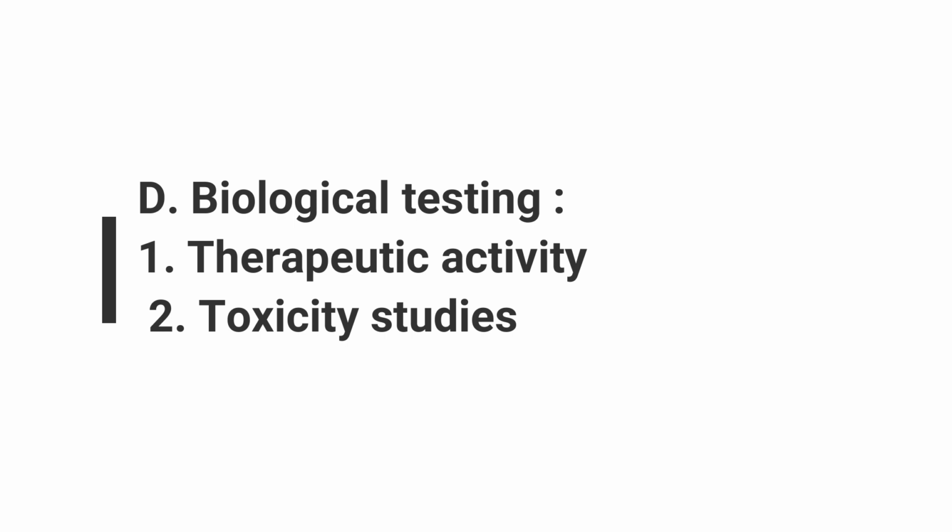Next, the second one is toxicity. For inhalation aerosols, test animals are exposed to vapors sprayed from the aerosol container. For topical aerosols, irritation and chilling effects are determined.